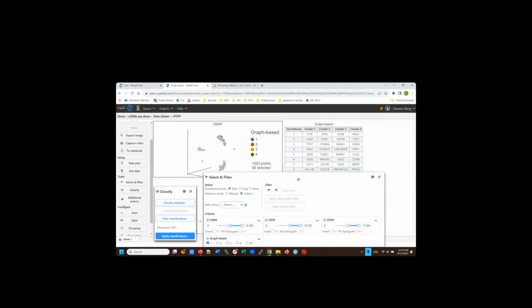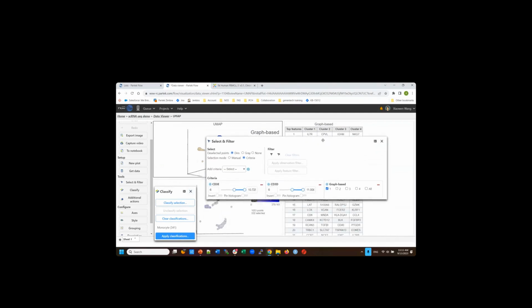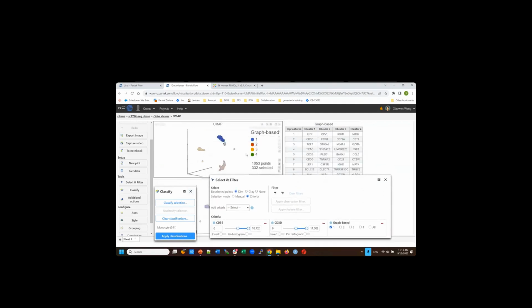I want CD8 to be high, greater than 5, whatever. So you can add as many genes as you want, but this is kind of too much, right? Most of them are not. I'm going to remove this one. I always look at the feedback and the visualization, combining all the information visually, statistically, biologically, all together, and you make a decision.